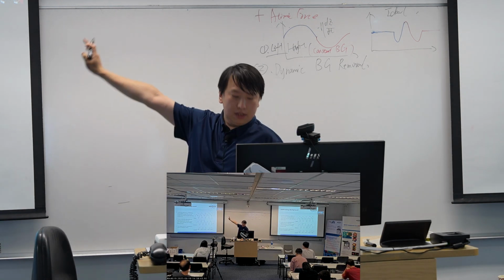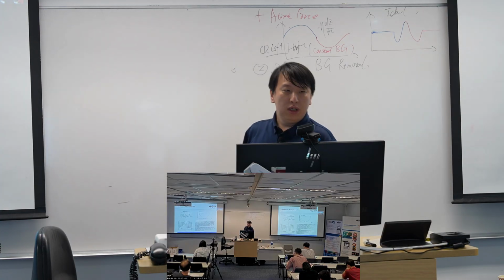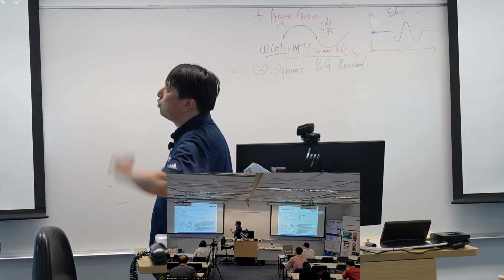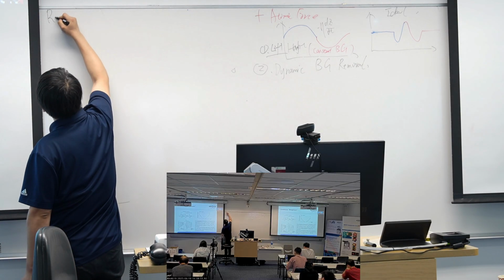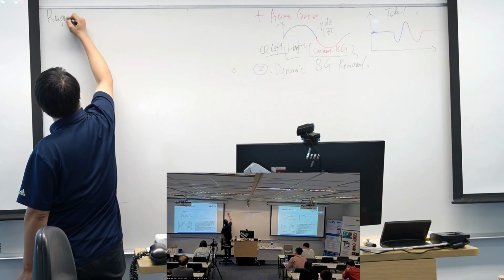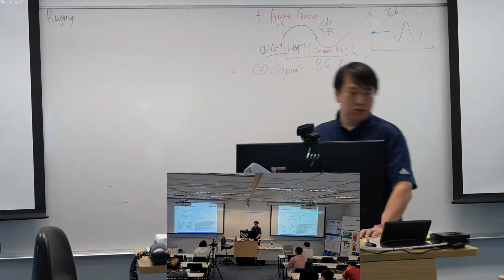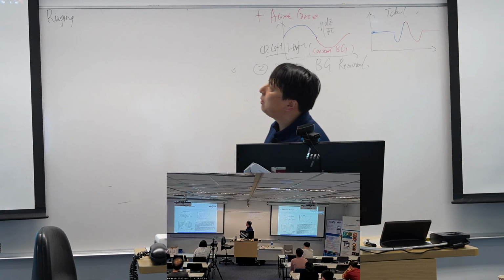So after this, after background removal, we may have another thing to consider. It's the so-called ringing. Ringing is also easy to observe during the PeakForce tapping.